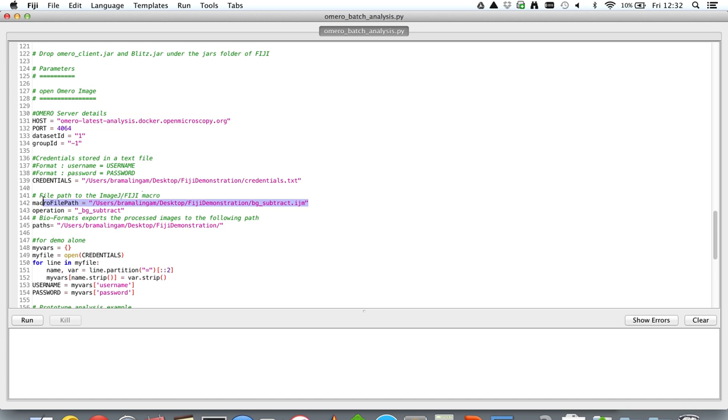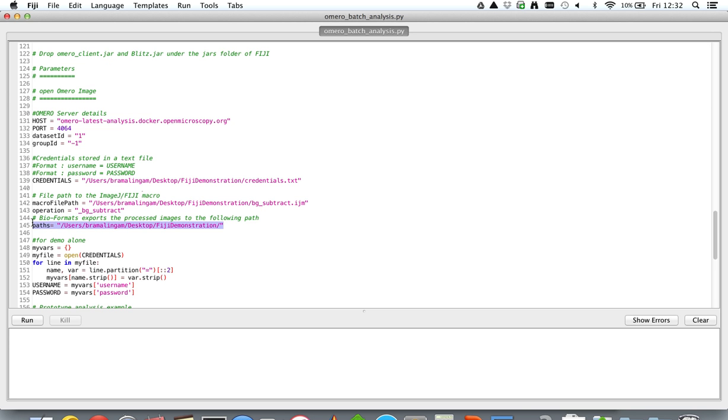The Fiji or the OMERO macro file and its path needs to be updated over here, and then eventually the path where the processed image needs to be written before being uploaded into the OMERO server.